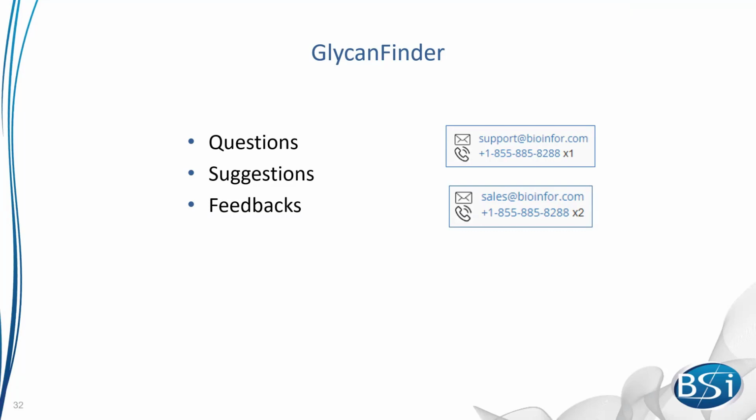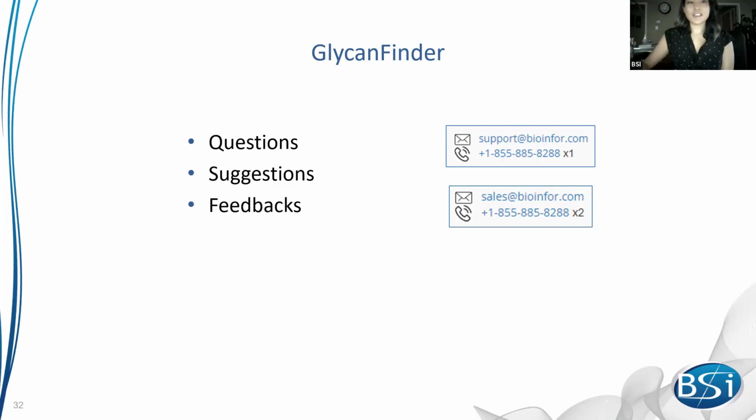Yes, for different samples, we have to go into the profiler. It is a more detailed profiling tool. Okay, perfect. Thank you. Great talk.